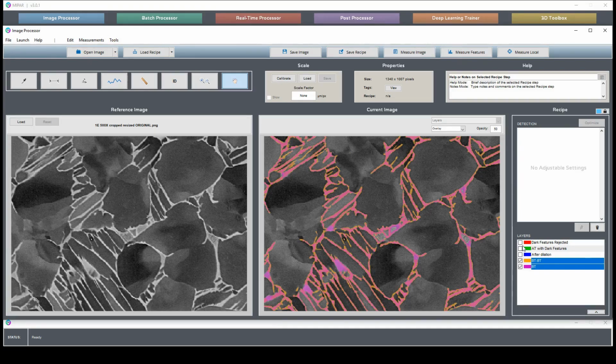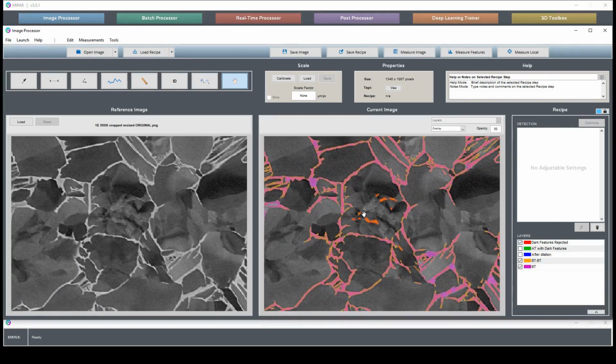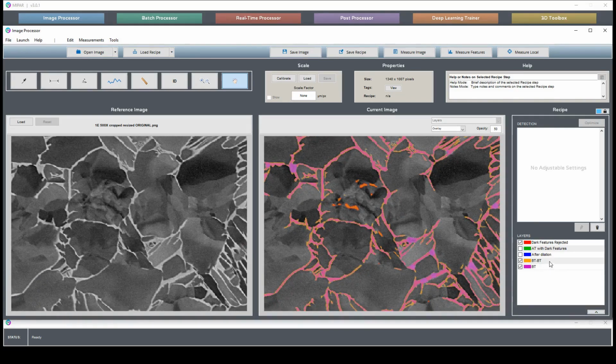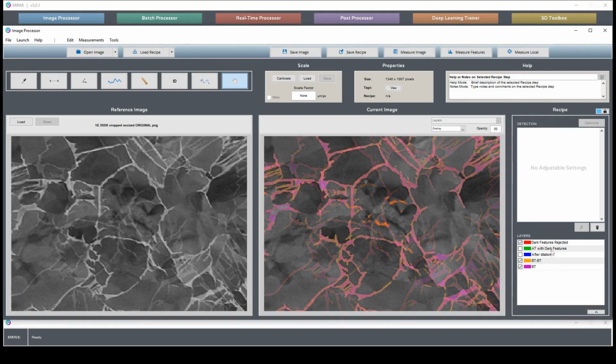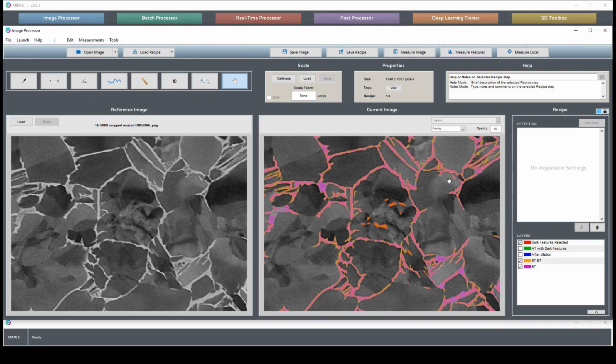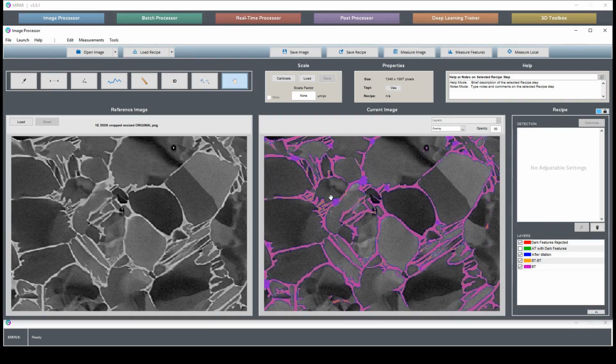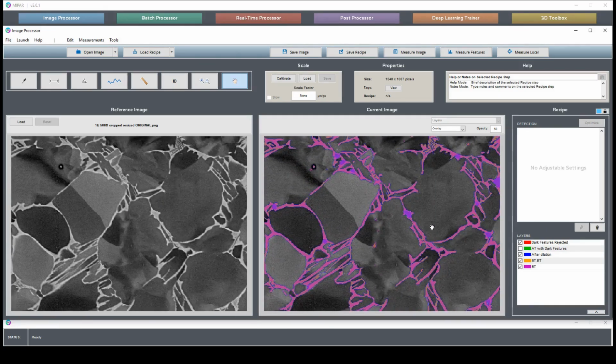Okay. And now these are the dark features that are being rejected. You can see these right here. Of course, they are added by the bright texture. What we might have been able to do is remove this rejection step if we could somehow remove this bright texture. But we know we can't because we need both of these together. And we've got this dilation part that's necessary for making sure that our features are well joined before the dark features.